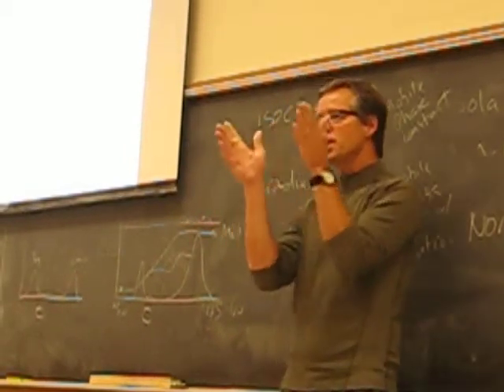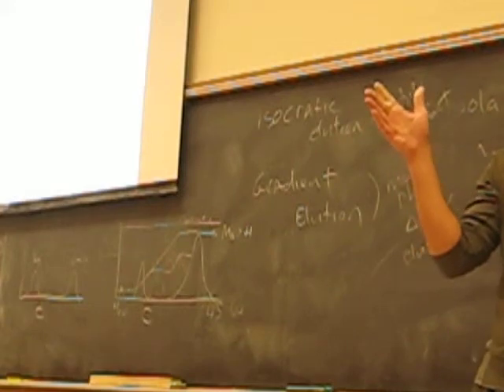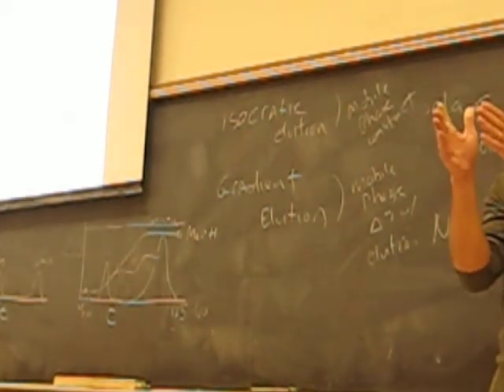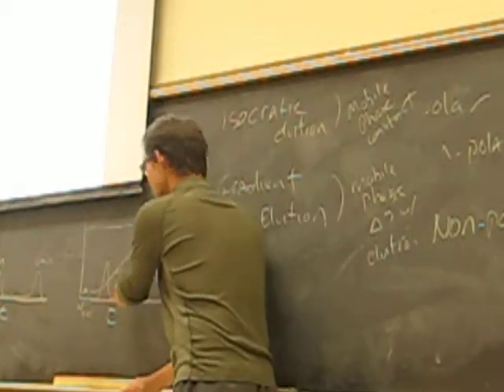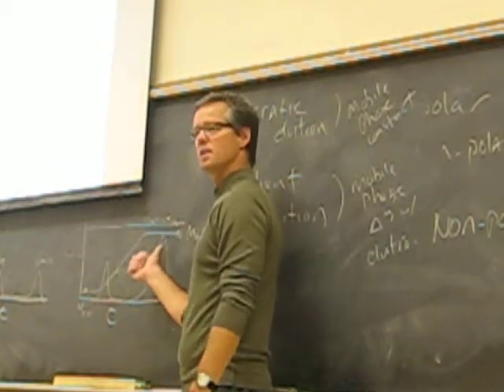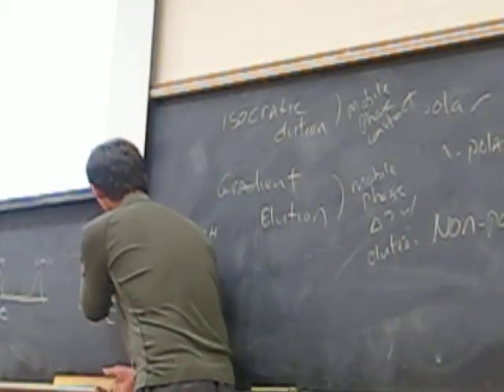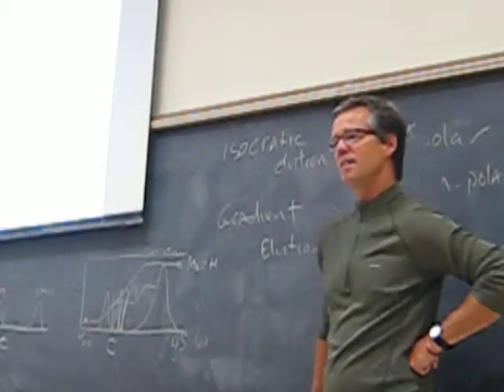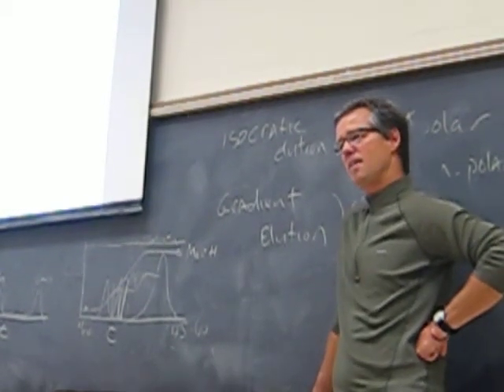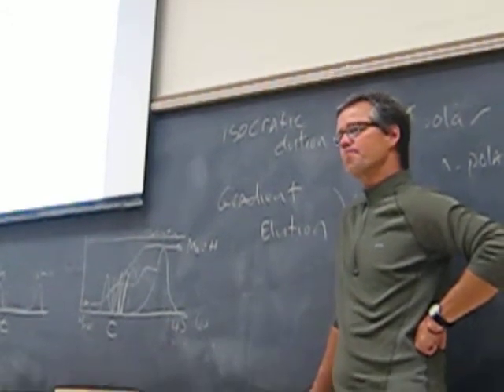The peak shapes change, and the faster you go, peaks don't get eluted as effectively, and you start loading things together. If you had a chromatogram like this, you'd be like, yeah, I'm going to speed this thing up, because all I've got is 2 peaks that are pretty far apart. But a lot of times you'll have peaks like that. Right. But at the same time, if you change the gradient, make it a less aggressive gradient, you can still. Yeah, that's right.